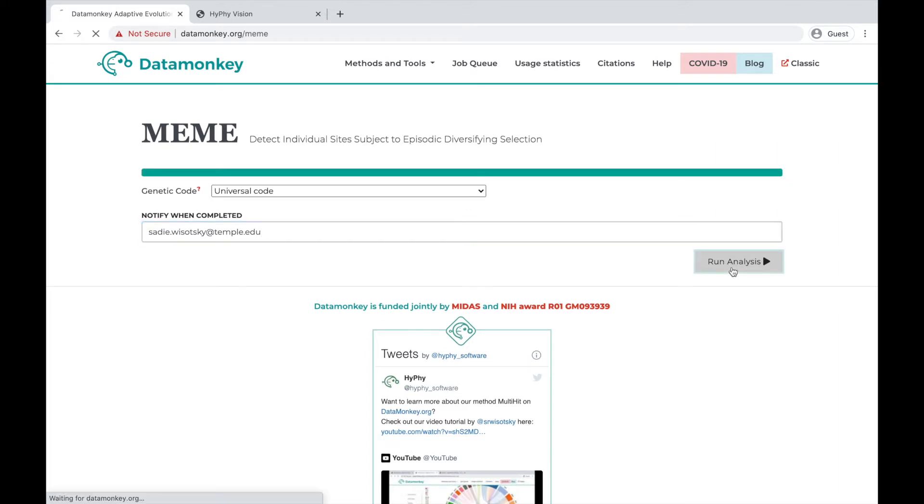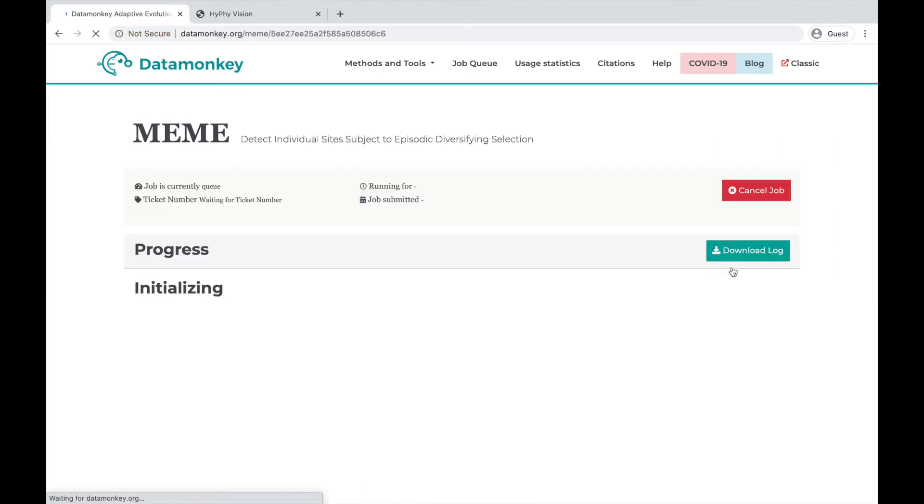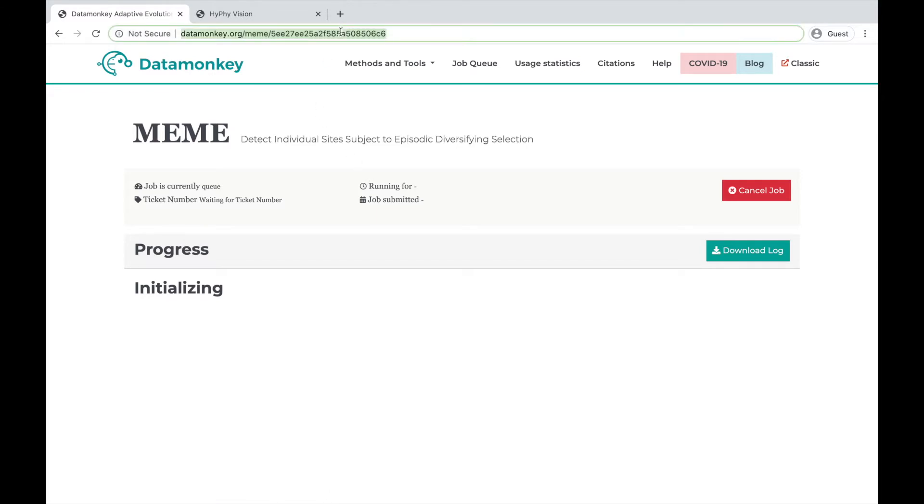Then hit run analysis. Once you hit run analysis, you'll be given a unique job URL that you can save. Here we're just going to copy it. This URL will take you back to the progress page as the job is running and the summary page once it is finished.